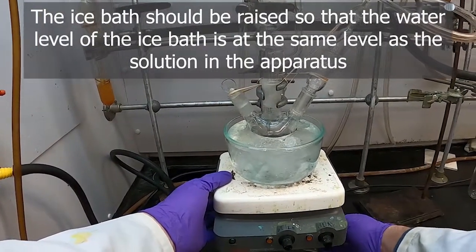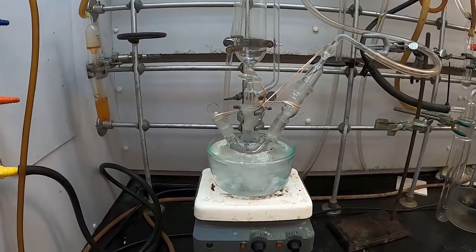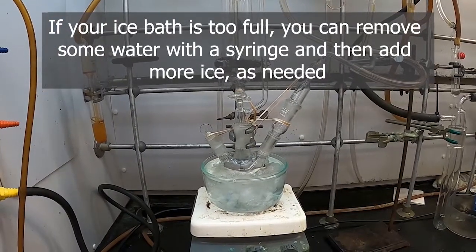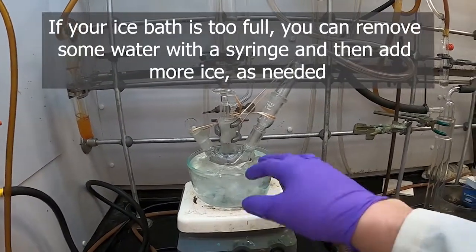So here we can see that my bath's actually not too full. I'm quite close to the top, but I think I could cover the level of any solution I was trying to chill in this bath quite easily without overflowing my bath.